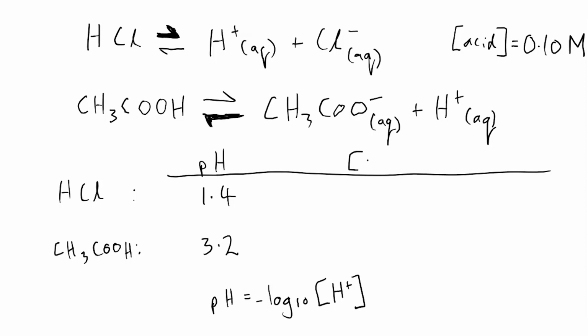So the concentration of H+, square brackets for concentration, in the HCl was 0.0398 molar. Now what does that mean? We dissolved 0.1 molar, and this is about 0.04. So about 40% of it is actually dissociated in practice. Now there might be some issues with our experiment because I think it probably goes even further than that. But certainly the concentration of H+ ions is about 40% the concentration of the HCl according to our experimental data.